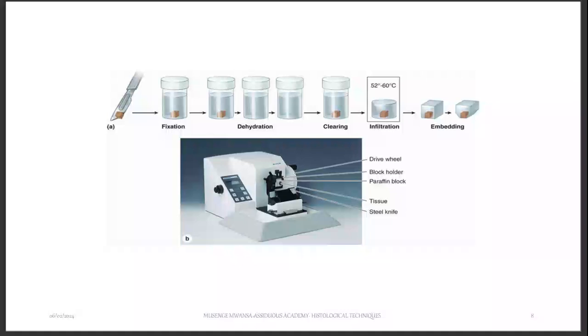Okay. So this instrument that you can see here is known as a microtome. The microtome is going to have a point where you put a tissue, and then the tissue is going to be cut into very small specimens. You need to know how this one is looking because it can come in your histology practical test. Identify the instrument. When you see this instrument, it is a microtome. What is its function? It is to cut tissue into thin specimens that you can view under a microscope. So these are the stages for tissue preparation. You need to know the stages in order.